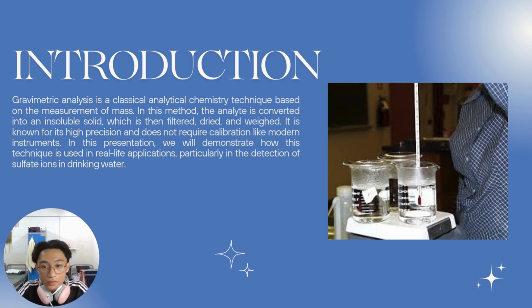Introduction. Gravimetric analysis is a classical analytical chemistry technique based on the measurement of mass. In this method, the analyte is converted into an insoluble solid, which is then filtered, dried, and weighed. It is known for its high precision and does not require calibration, like modern instruments. In this presentation, we will demonstrate how this technique is used in real-life application, particularly in the detection of sulfate ion in drinking water.